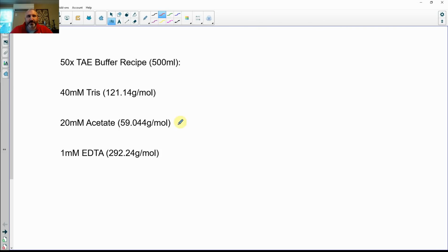Hi, everybody. So as you know, this is completely optional, but I figure it would be very helpful for you to do it. So let's go through this. The first question asks for making TAE buffer, and we're going to need 500 milliliters of it. So the recipe is here.